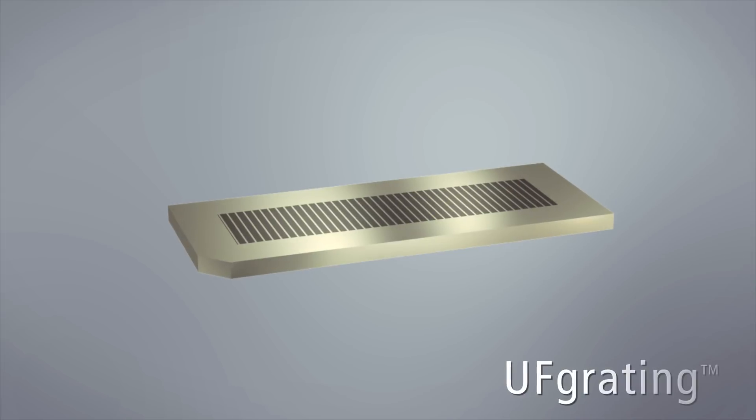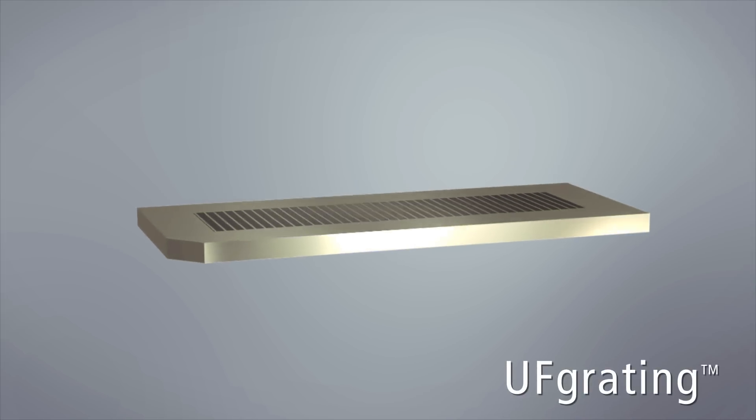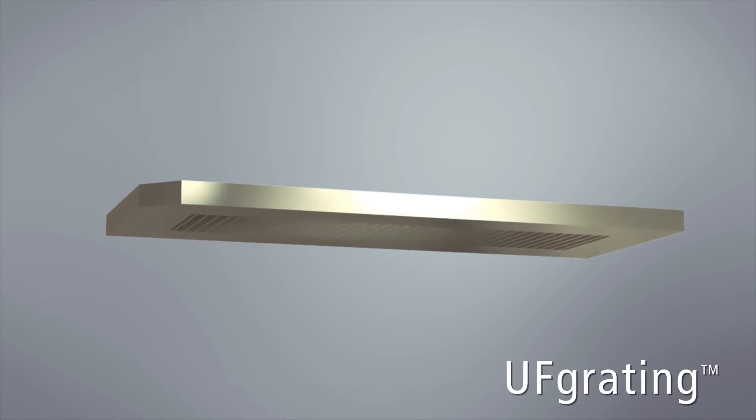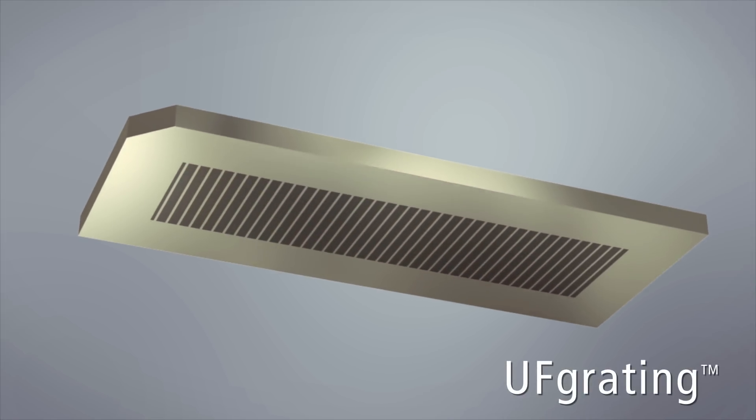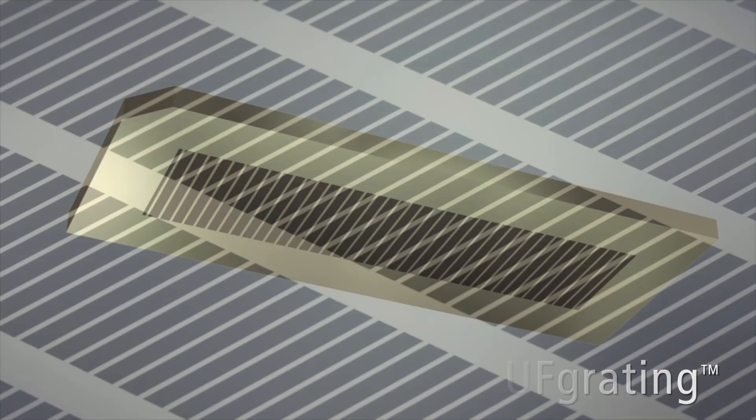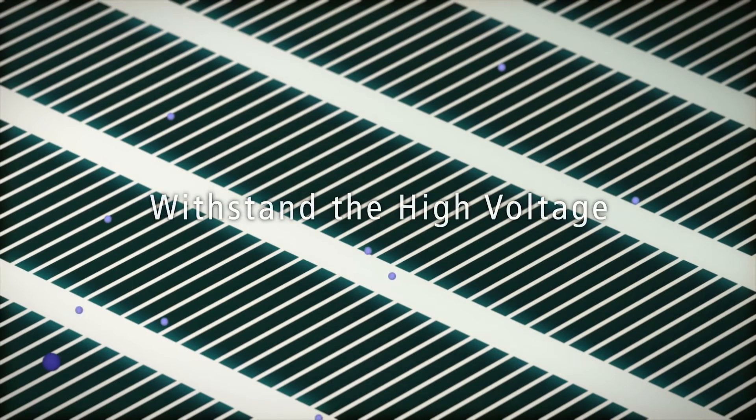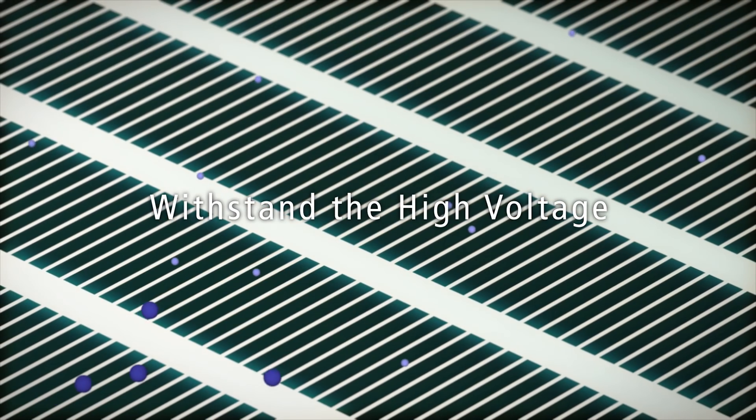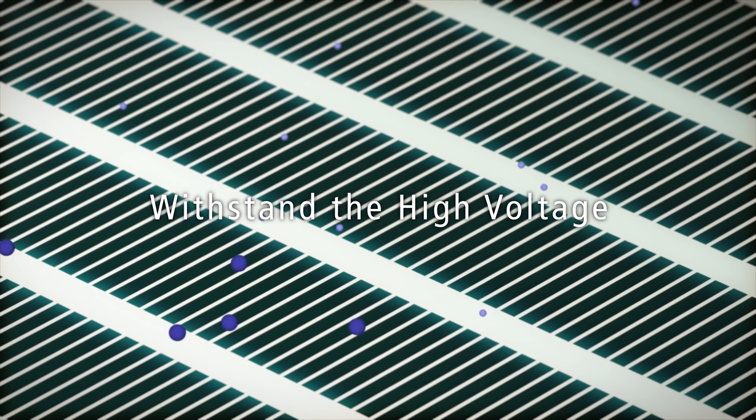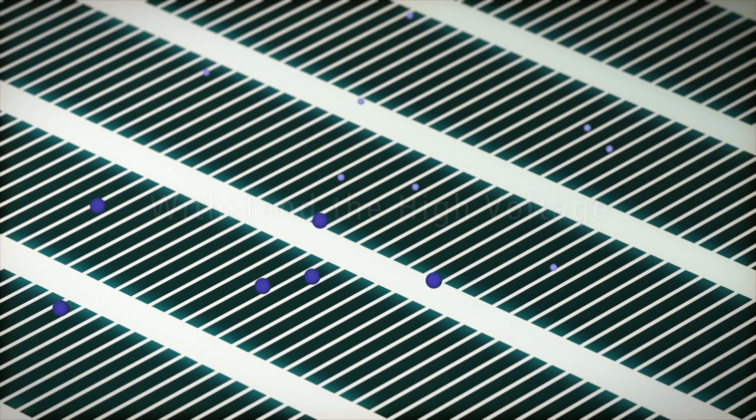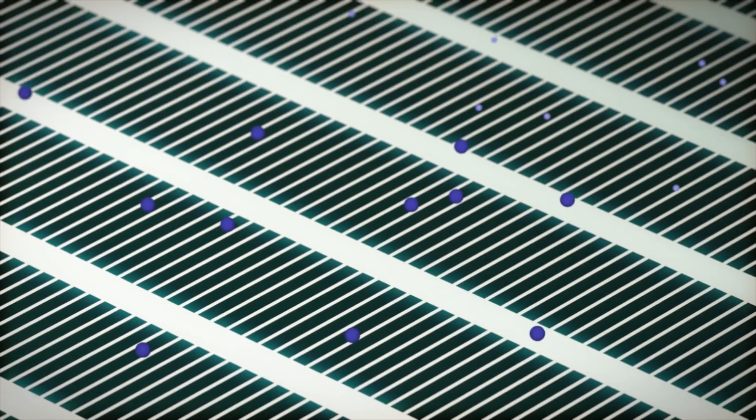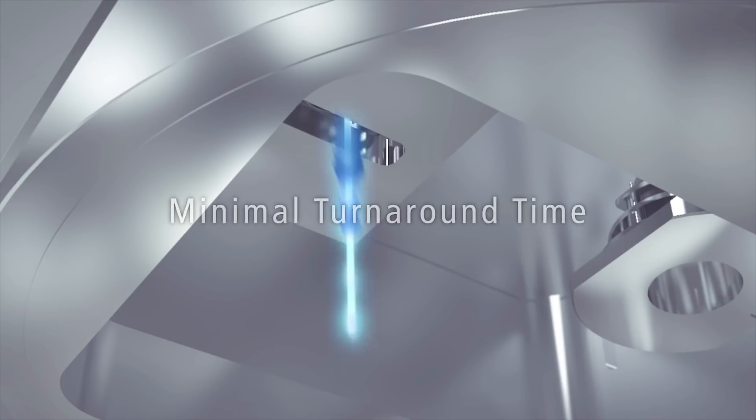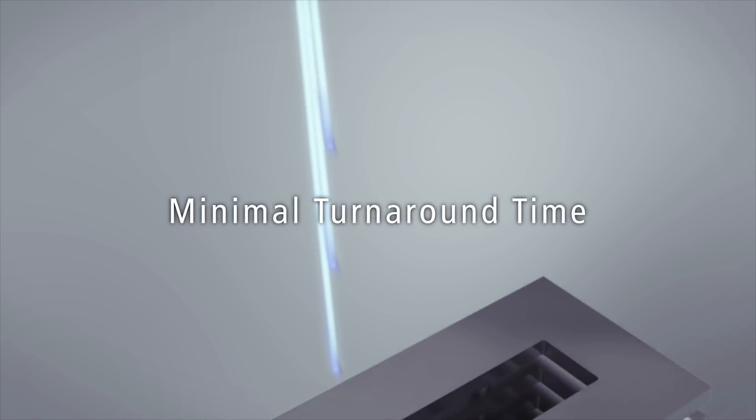Shimadzu's specialized manufacturing capability is clearly demonstrated in our UFgrating, an advanced electrode system which has outstanding mechanical strength to withstand the high voltage needed for guiding ions into the flight tube with minimal turnaround time.